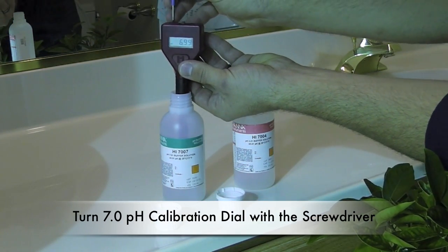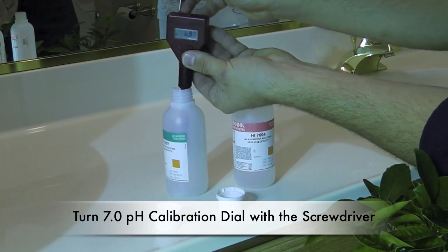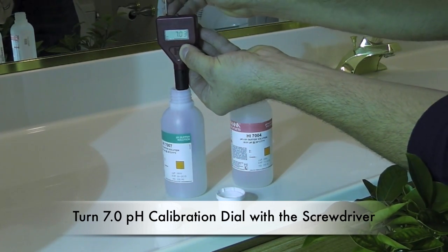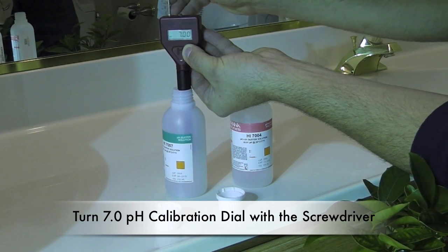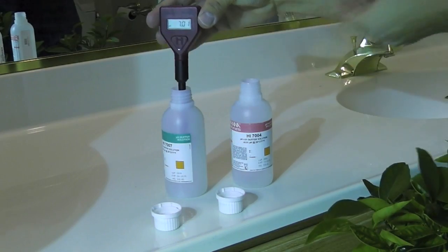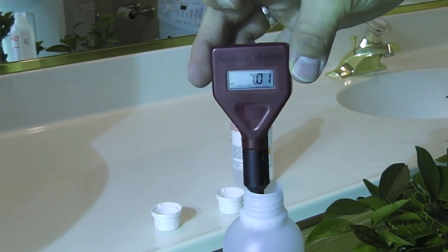It's pretty close. I think the bottle says 7.01. So I'll stick it at that, as you can see.